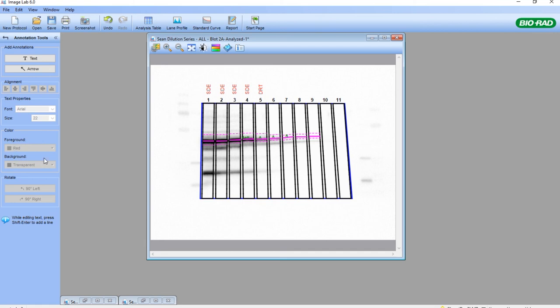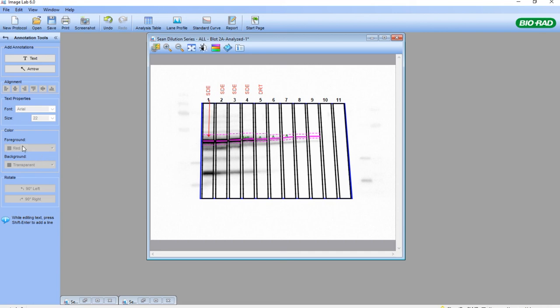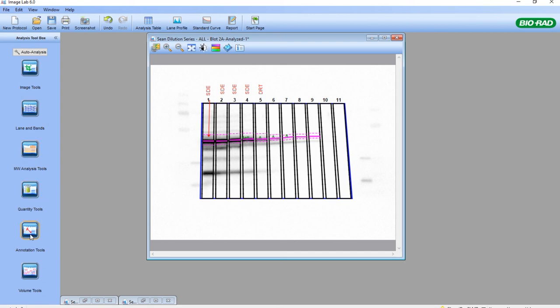We can also add arrows if we wish to point at particular features on the membrane. The arrows can be adjusted, moved, and also changed in color. These are how we use molecular weight analysis, quantity tools, and annotation tools. There will be further modules on how to perform relative quantification in western blotting with normalization.